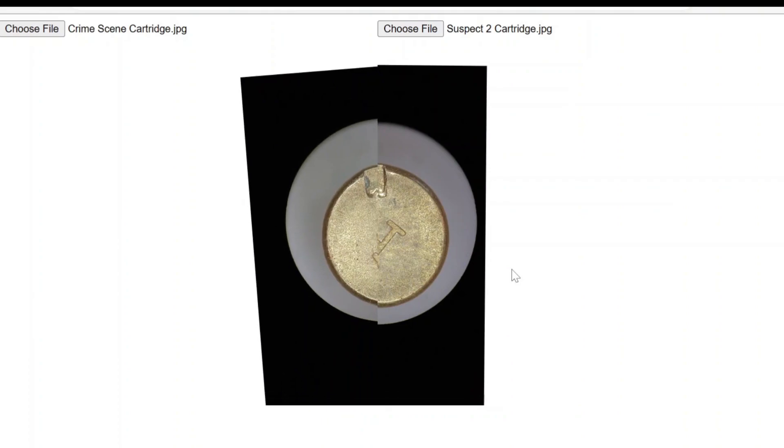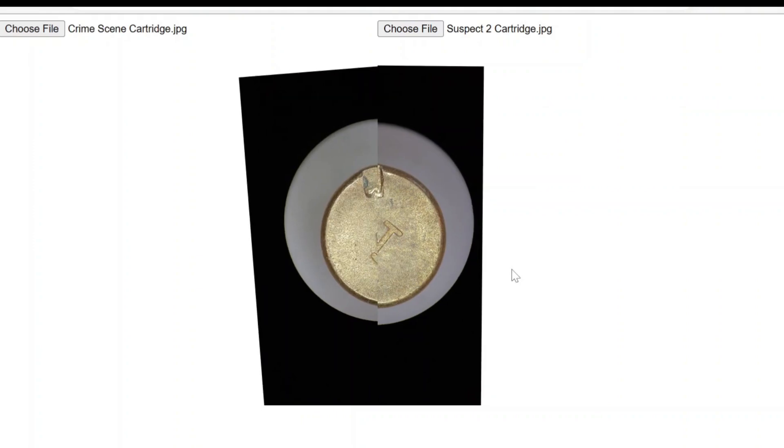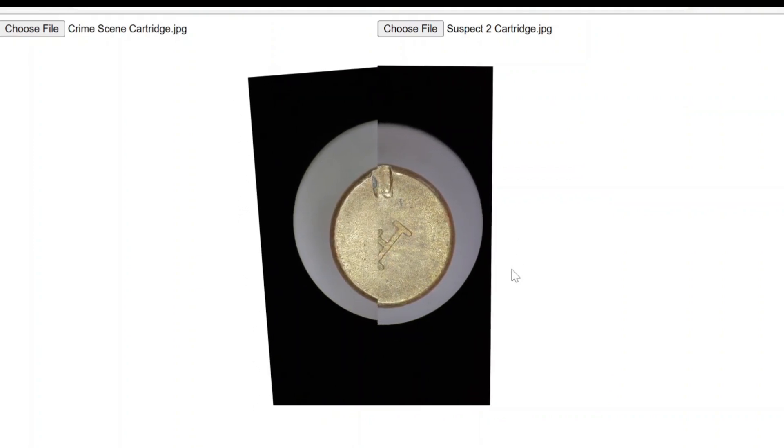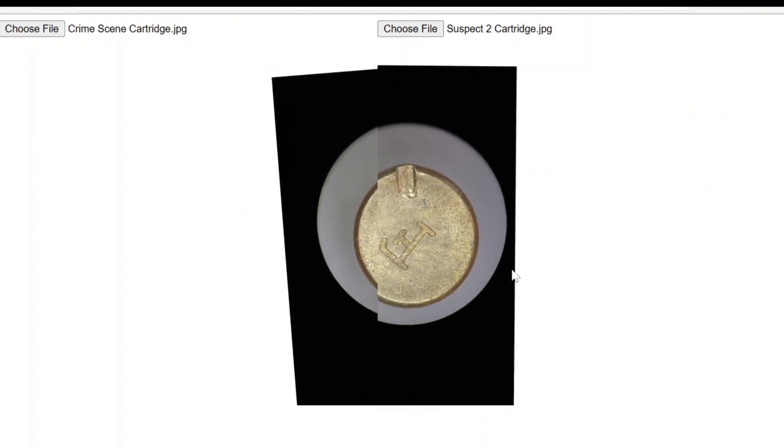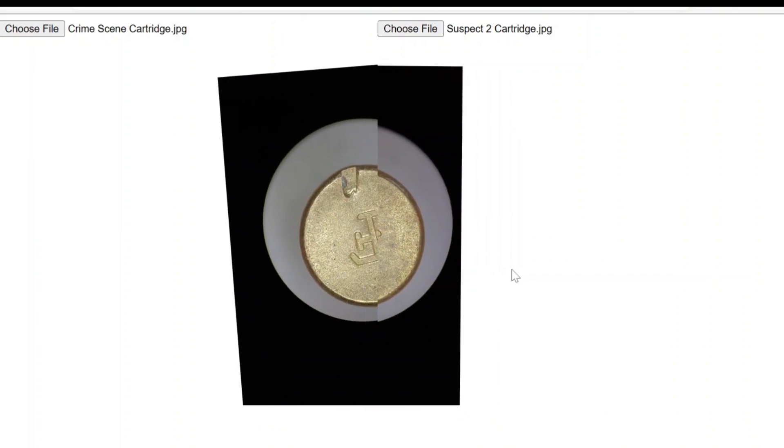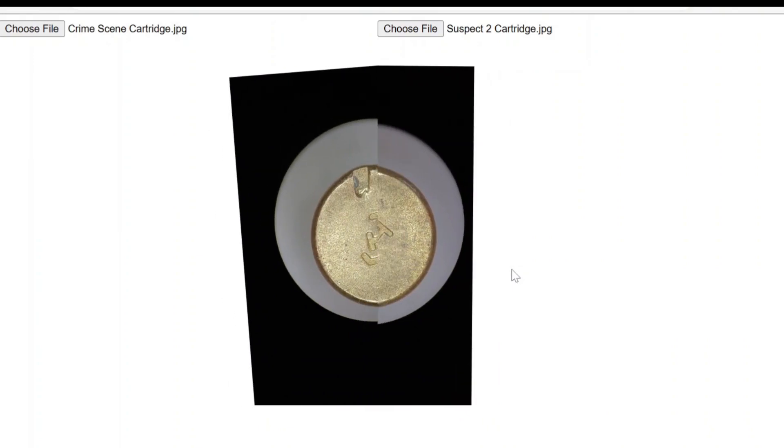And it looks like these I would say are not a match, just because you can see the firing pin impressions, they're different shapes. So that's a virtual comparison microscope. Hope you found that helpful. Okay, bye.